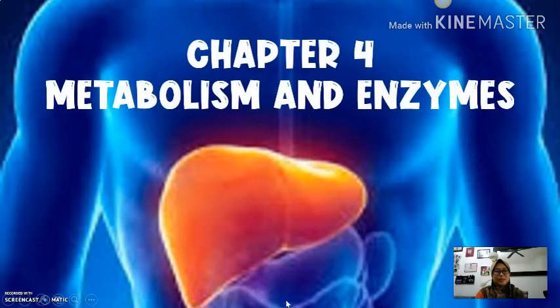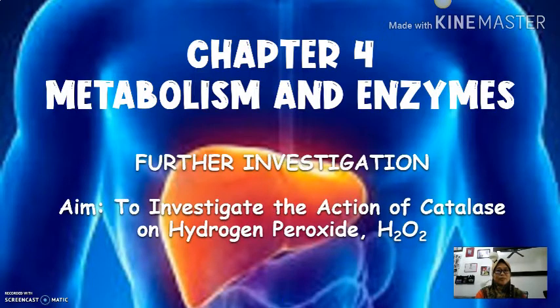In this episode, I would like to share with you the students' further investigation, which became the project-based learning in Chapter 4, Metabolism and Enzyme. The aim is to investigate the action of catalase on hydrogen peroxide.